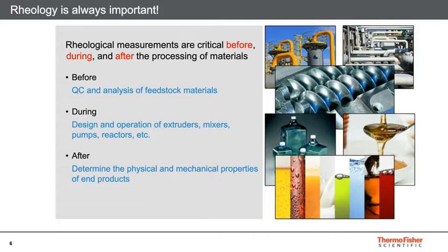And then once you have your final material, you need to make sure that the material is exhibiting the physical and mechanical properties of its intended end use. And those mechanical properties are suitable for the end user and the desired application. So rheology is everywhere. It's in all the materials you use. And it's always important regardless of the stage of life of that material, from the beginning to the end and throughout its intended end use.